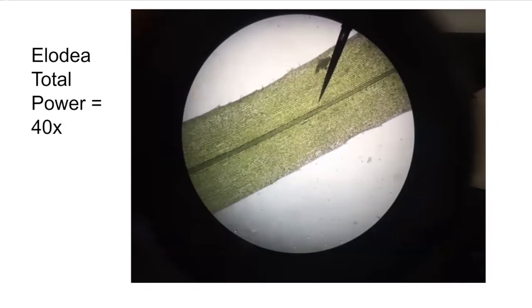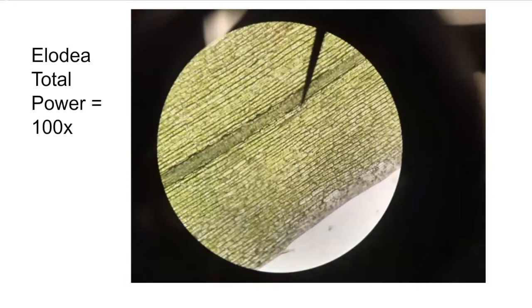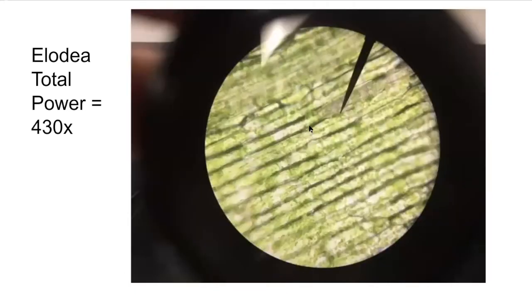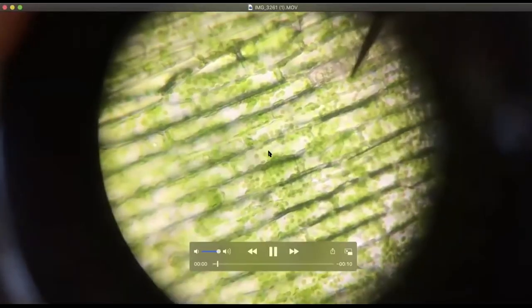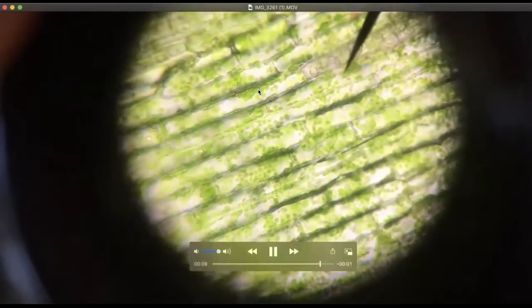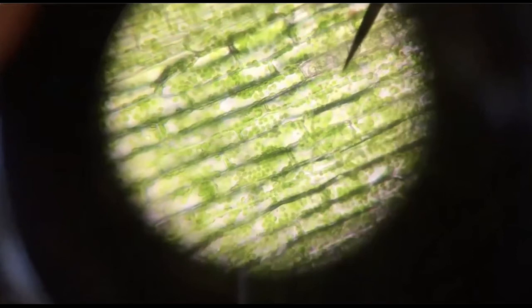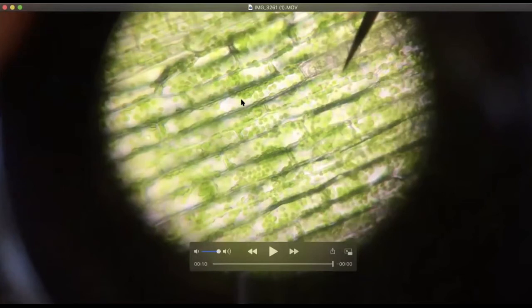This is our Elodea on low power at 40 times magnification. As we increase to 100 times, you can see the rectangular shape of these cells. At 430 times magnification, we can see the cell wall, the cytoplasm, and these little green bubbles — which are chloroplasts responsible for photosynthesis. We're not able to see the nuclei because there are so many chloroplasts. You can also see these chloroplasts moving around in the cytoplasm — this is called cytoplasmic streaming. Chloroplasts do this to avoid getting too much light, which would burn up the chlorophyll and prevent photosynthesis.